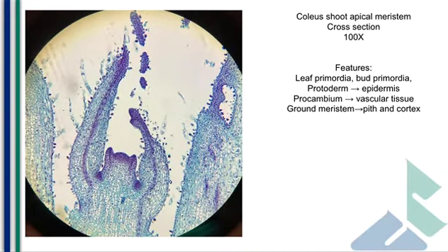And this hopefully shows you how our leaves and the vascular tissue associated with the leaves is connected to that of the stem. They mature together in our shoot apical meristem and then differentiate much later once all of the organs are formed, because these, after all, are plant organs.